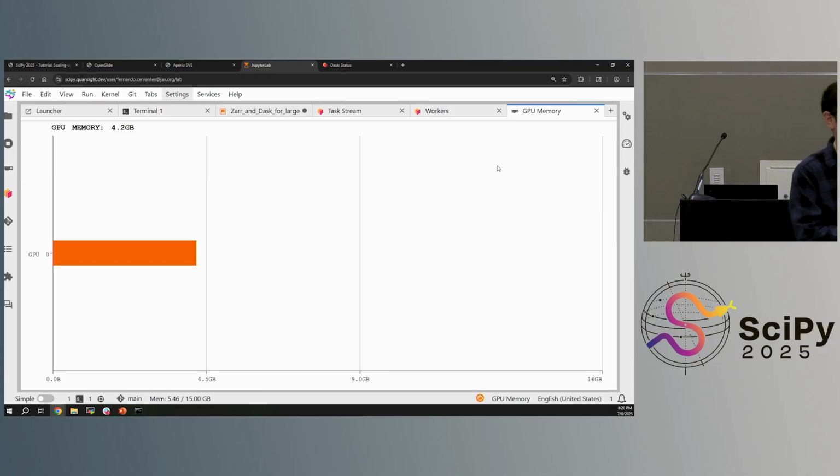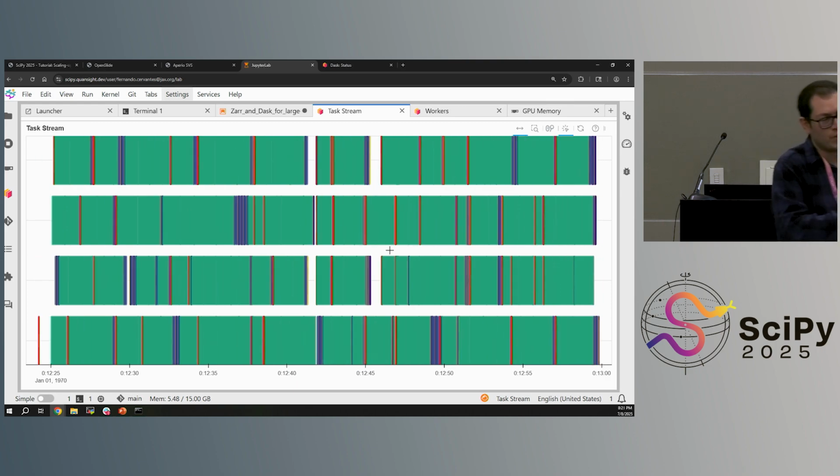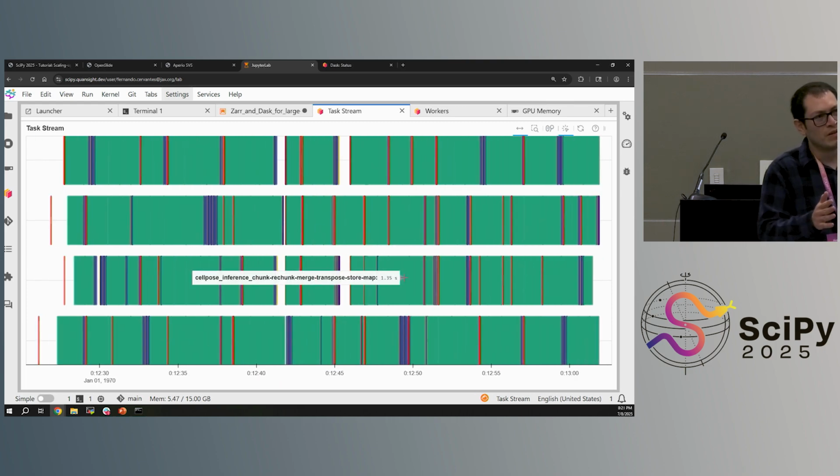Think about it, the resolution of your monitor is something like 4K. This image is 200,000 by 100,000 pixels. You can't display that anyway. So you're always looking at either a piece of the data, just a small chunk, or you're looking at a downsampled version. Because your monitor can't display 100,000 pixels by 100,000 pixels anyway.